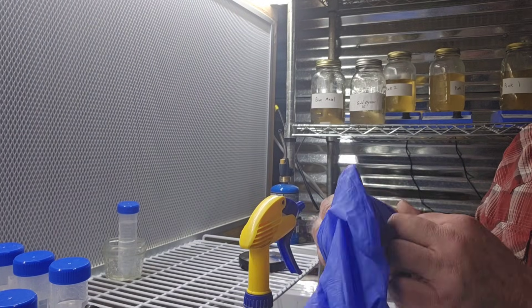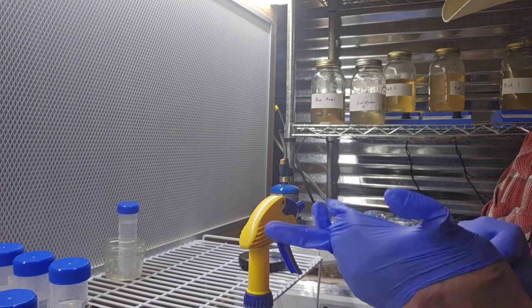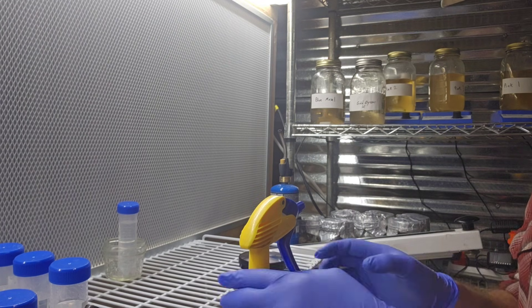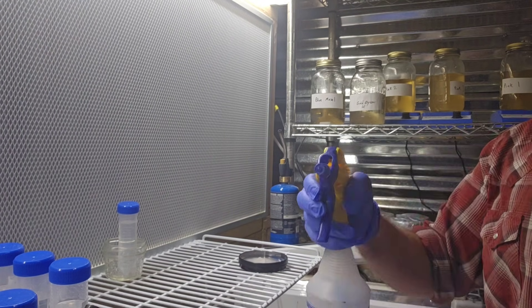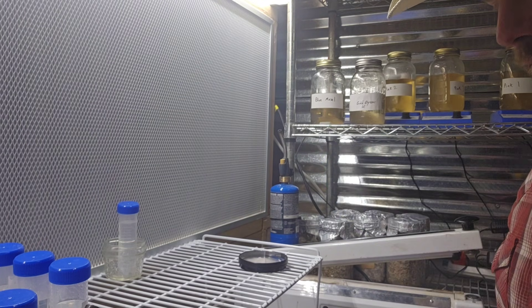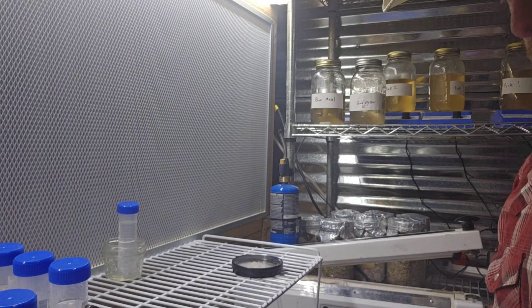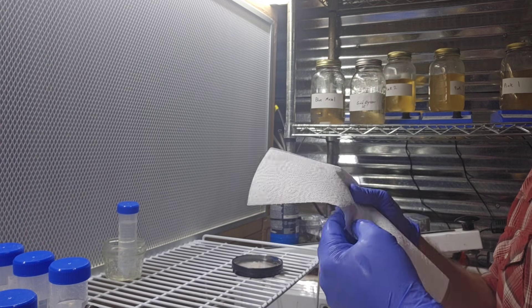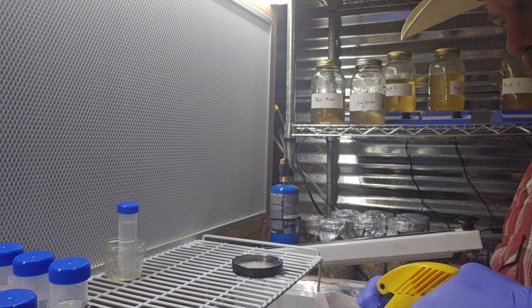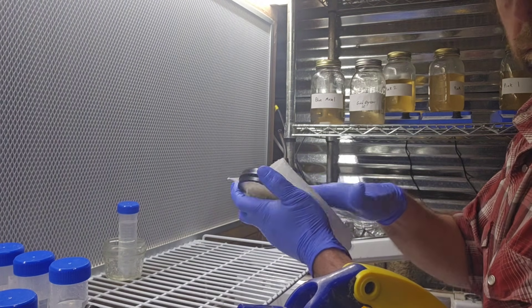I'm going to show you guys how we section off some of that mycelium on the agar and put it in one of these tubes. Doing a voiceover so I didn't have to talk while working. I'm getting all gloved up, putting some alcohol on the gloves to wash up, then showing you some of the tools. I've got a scalpel, some paper towels, alcohol, and the petri dish with mycelium growing on it. I've got my centrifuge tube in a nice glass so I don't accidentally tip it over. Now I'm putting alcohol on a paper towel and wiping down the petri dish.